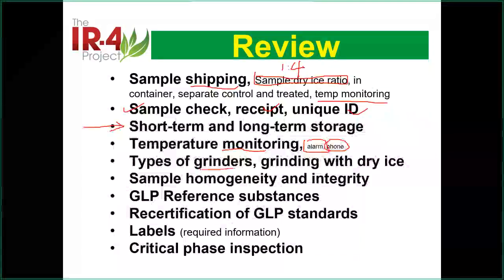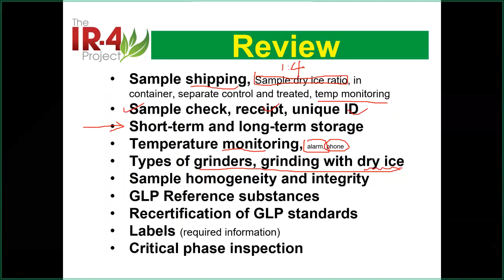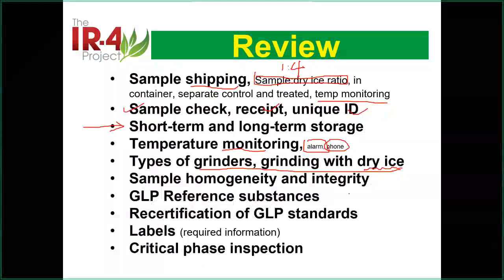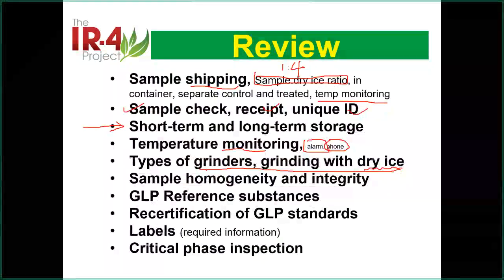We spent a lot of time talking about grinding. Yes, dry ice is necessary. If you don't have access to dry ice, you need to talk to the study director and make the arrangement. What is the best way to handle this? Sometimes it depends on the sample, depends on the work, it may work in different ways. So in order to keep the sample integrity and homogeneity, a lot of things we do is we need to mix them, we need to keep them. That's a long story, but anyway, that's what we talked about.